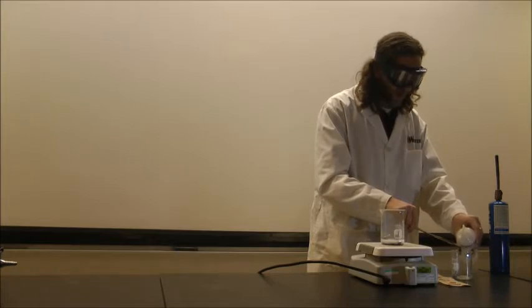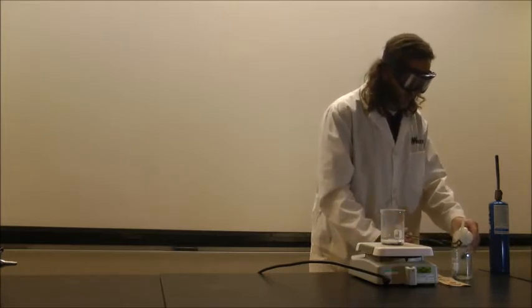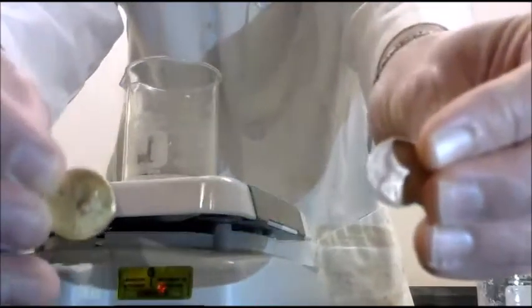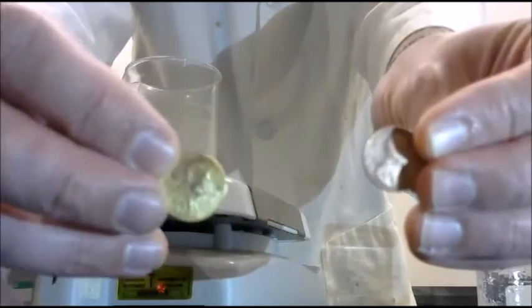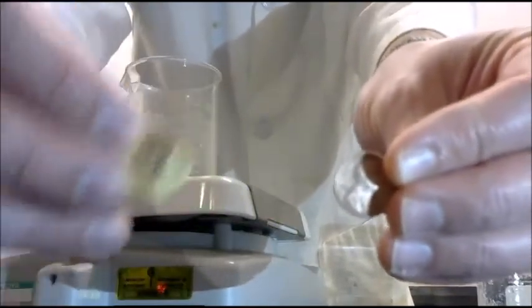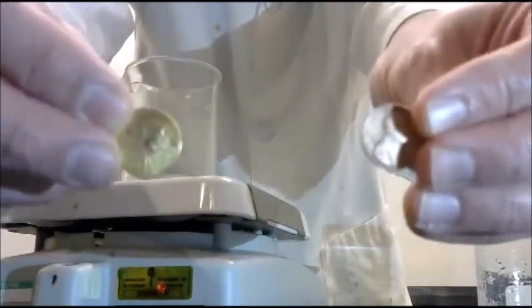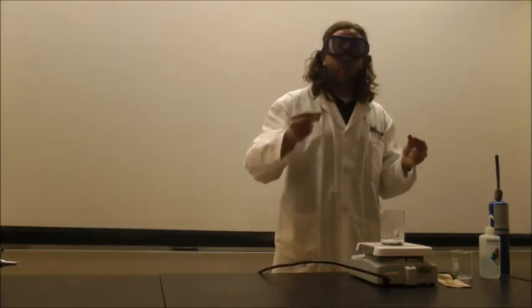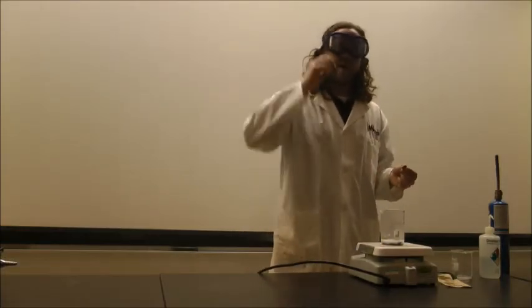So I haven't actually made gold pennies. What I've actually made are brass pennies. So you can see the apparent transformation from a copper penny to a gold penny, which is really a brass penny. So if you've ever seen somebody in a movie or a cartoon, whenever they get gold, they bite into it.